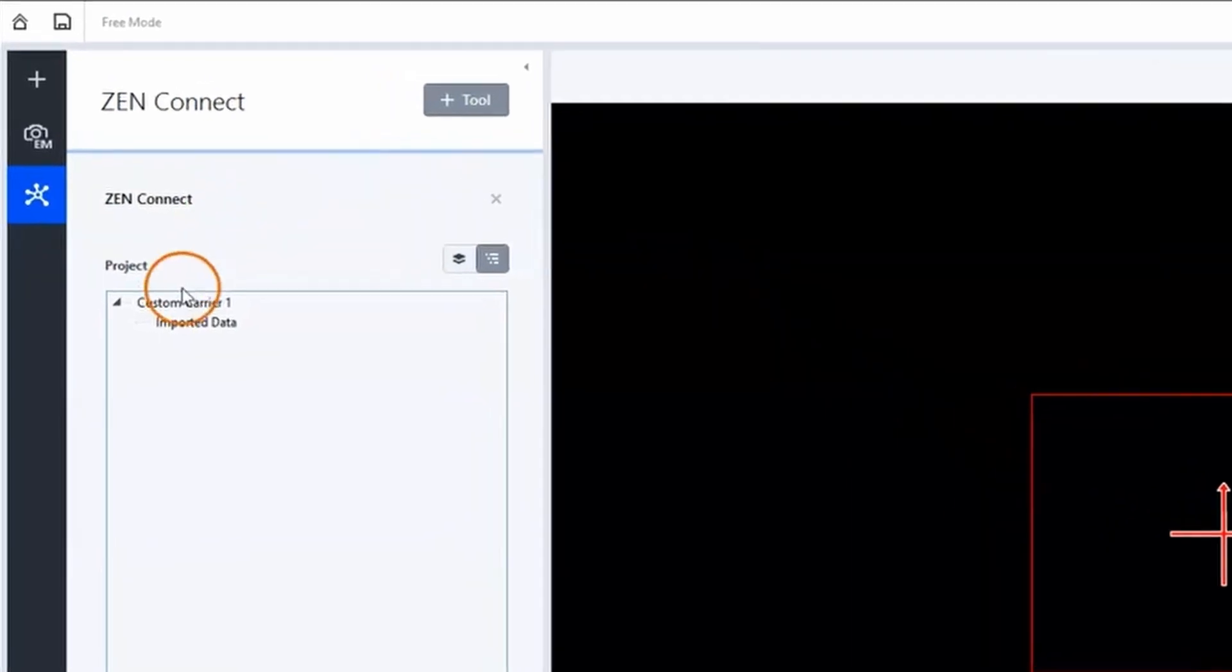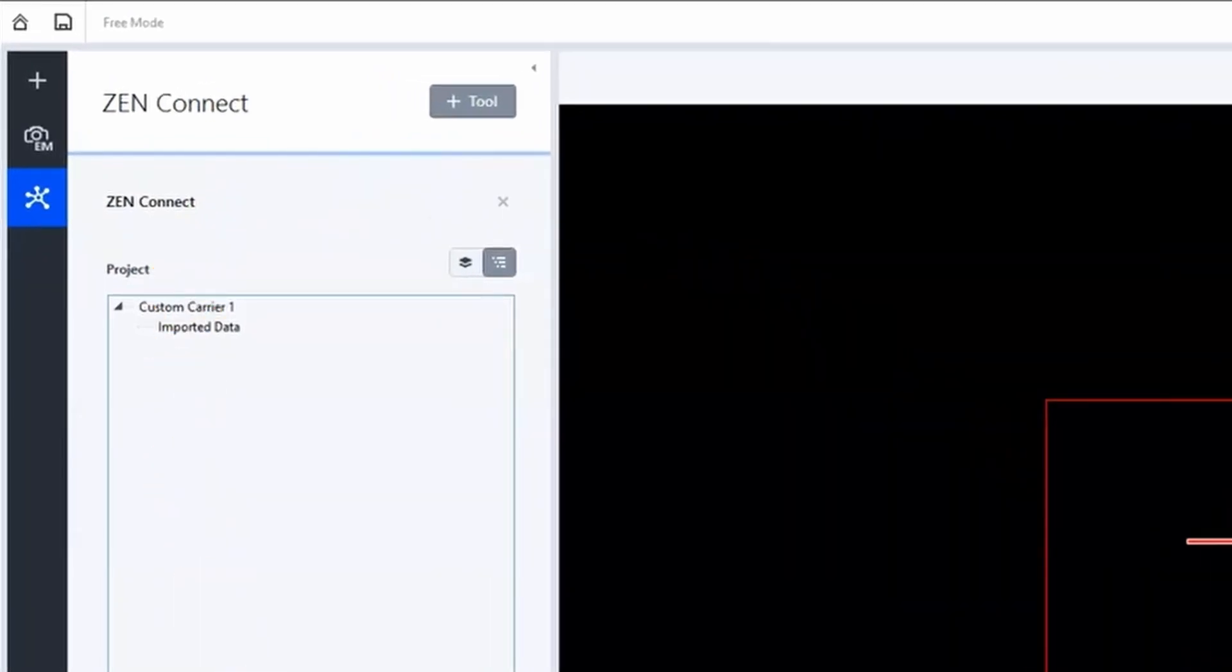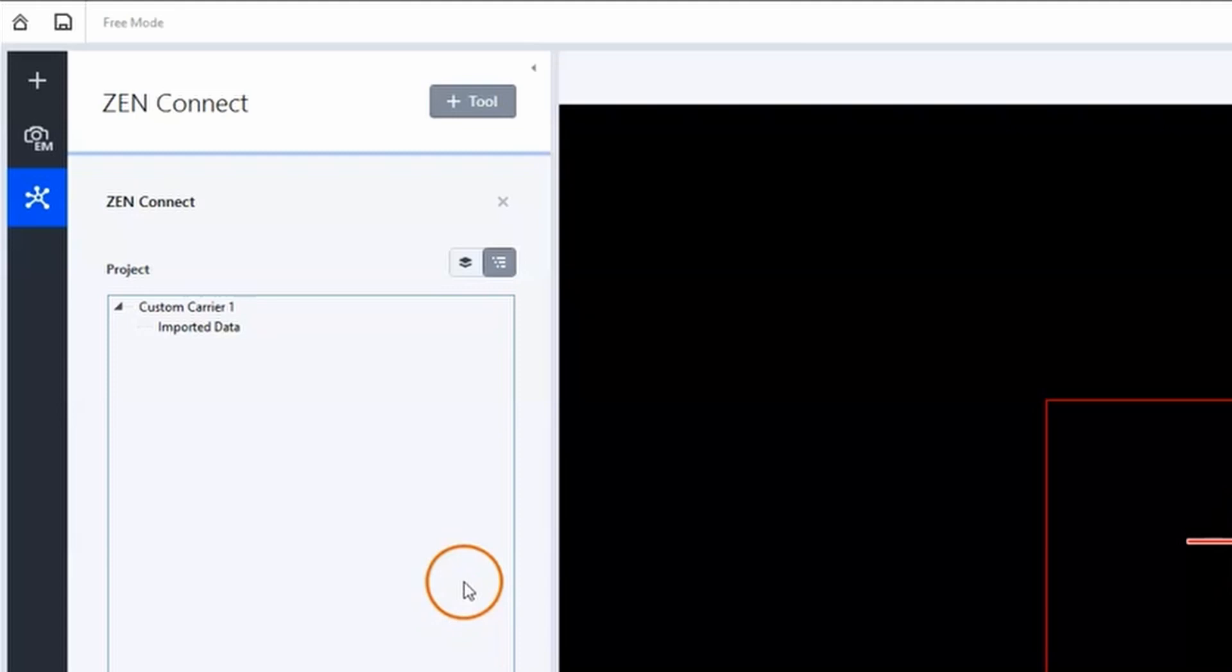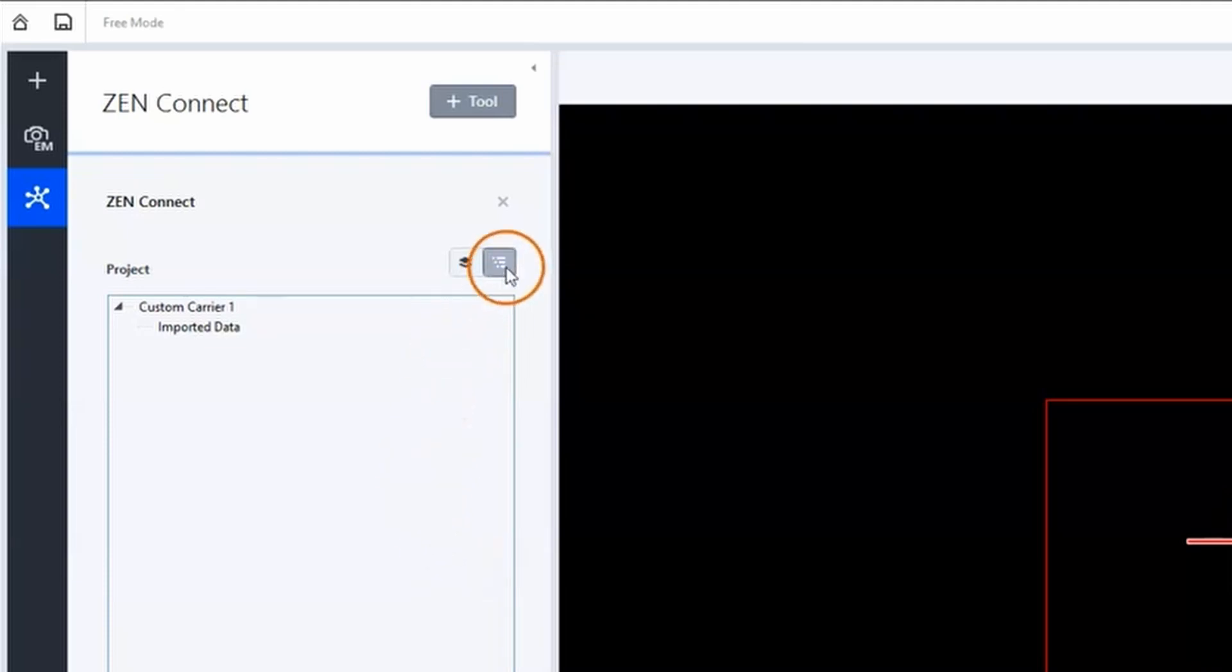On the left side there is the XenConnect project view. This tab helps you to visualize and organize your images and non-image data. It contains a project tree that is automatically and hierarchically sorting your images and data.